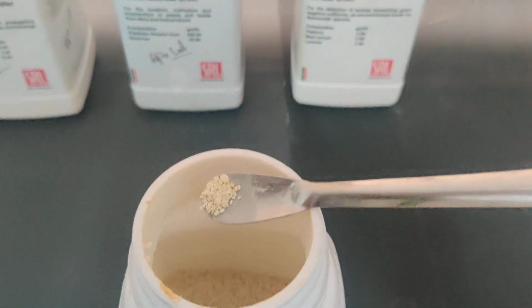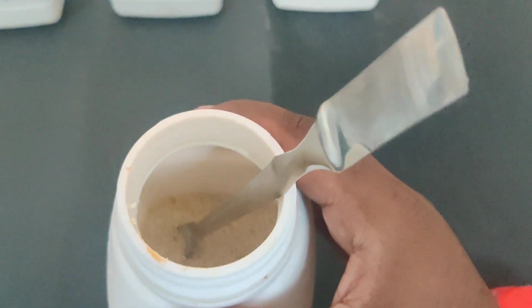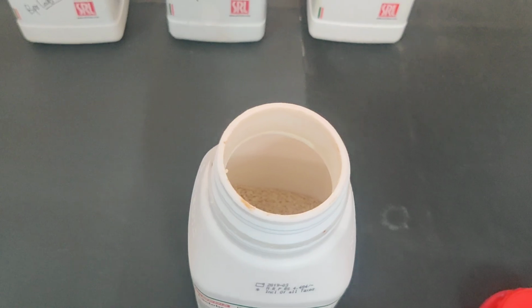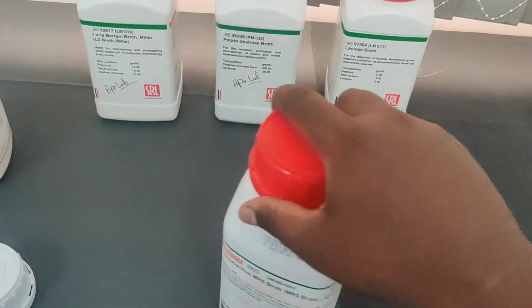The image that I am showing you here is a granulated form. If you take it and dissolve it in water, it will also get solubilized. It will be in the form of granules, a little like sand. Okay. So this is another form of microbial liquid culture medium, growth medium.